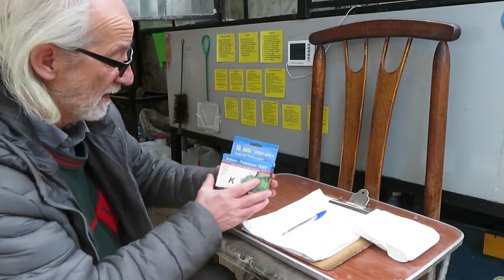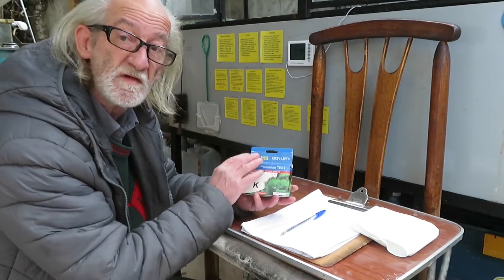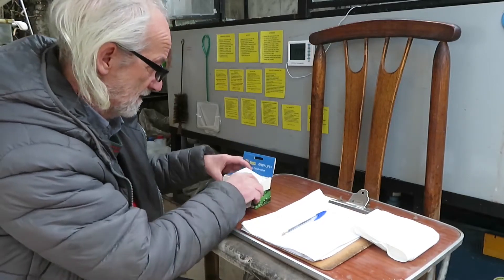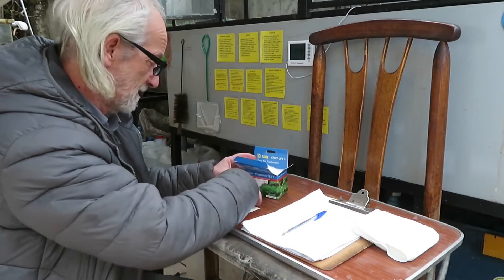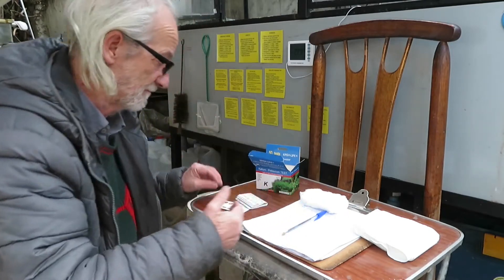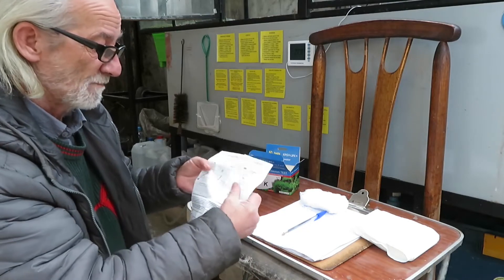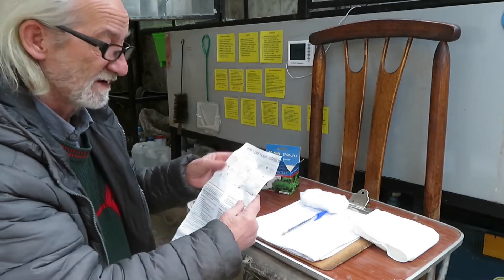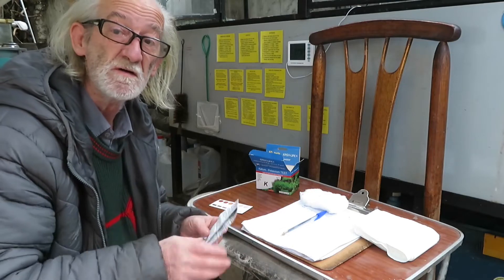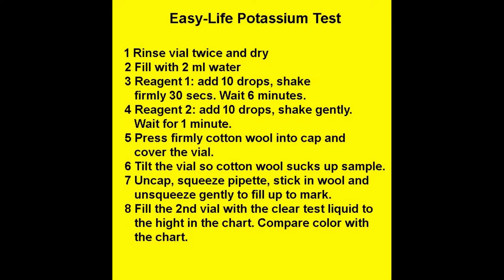Hello friends, in this video I want to show you how to do a potassium test with this kit from Easy Life. This is a simple test but it involves a series of steps. There are many steps here and it gets a bit complicated, so I think it's a good idea to put this test in a video so we can follow the procedure easily. I have also created a flash card to help us go through this test.